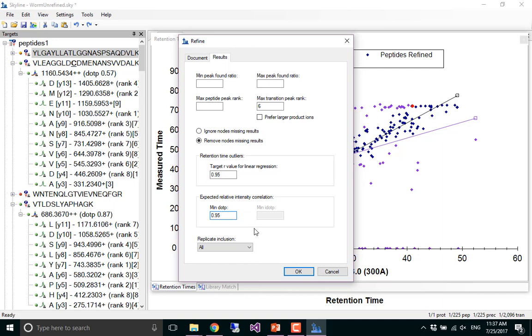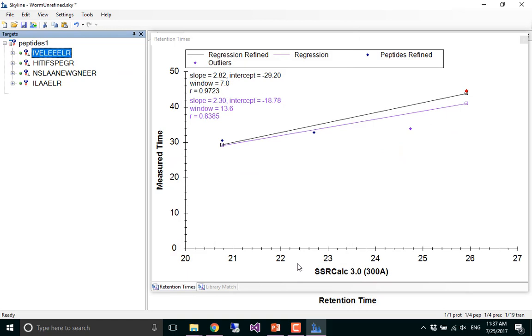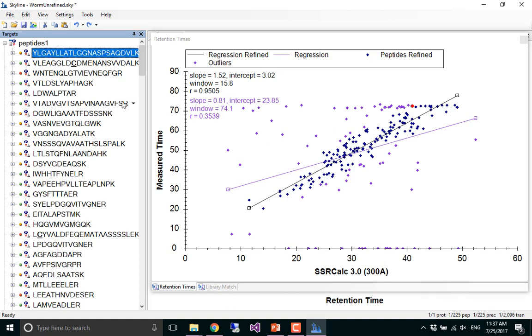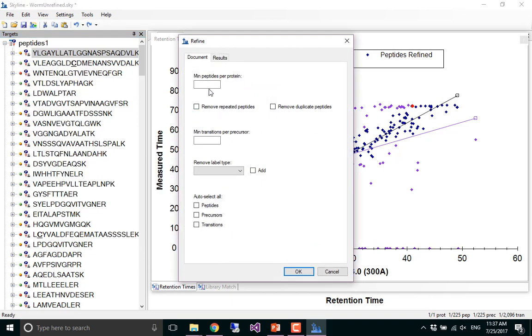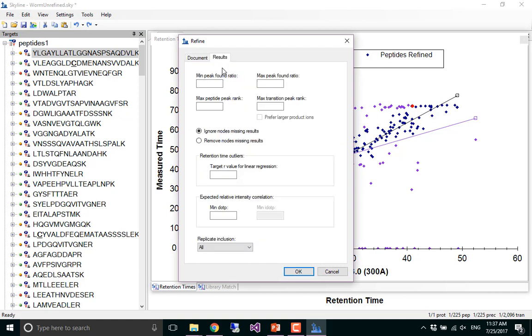And so knowing that we can always do undo, right? Is everybody set up that way? All right, here we go. How much really awesome data do we have? Whoa, boy, that is a lot less than I was expecting. I'm not sure what happened there. So let's try again. Edit, refine, advanced. Wow, that was terrible. That doesn't make any sense to me.